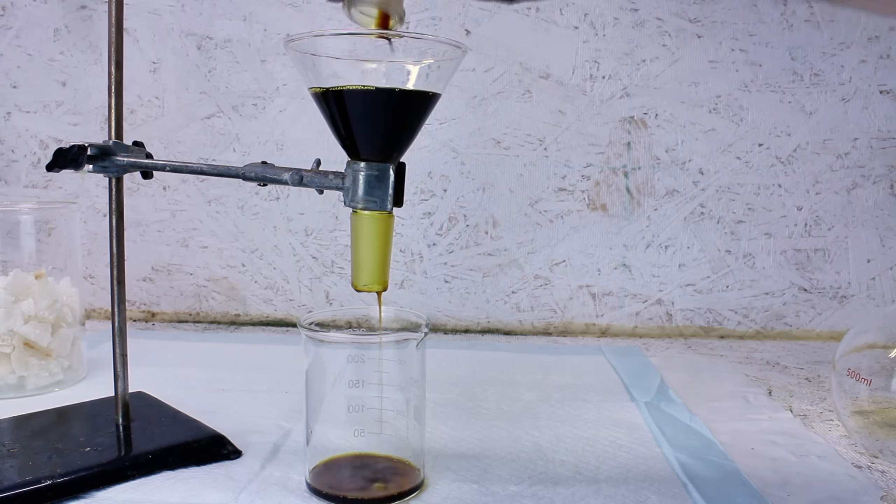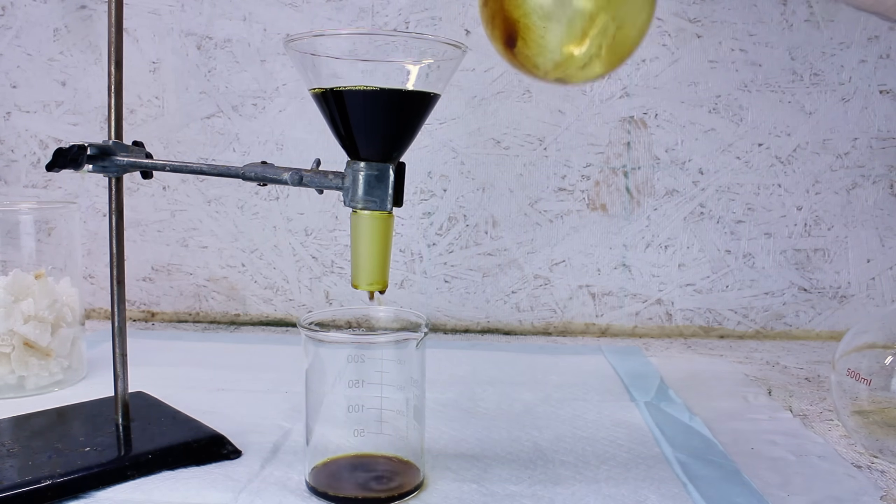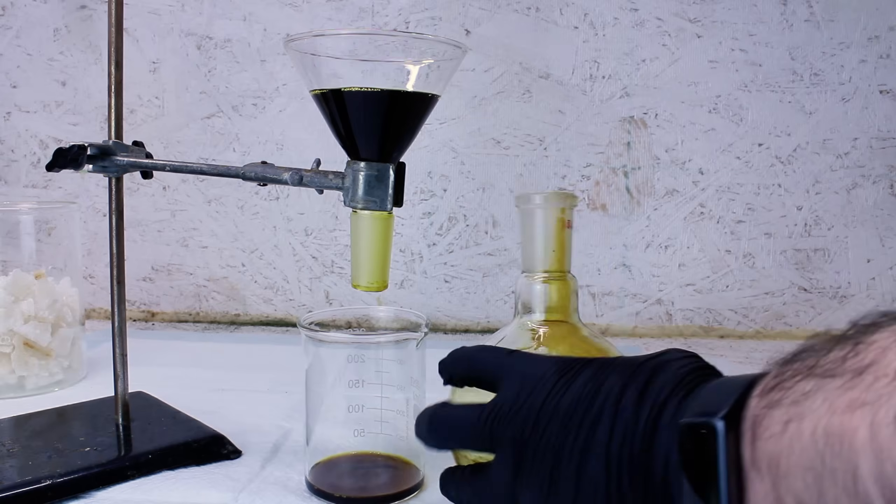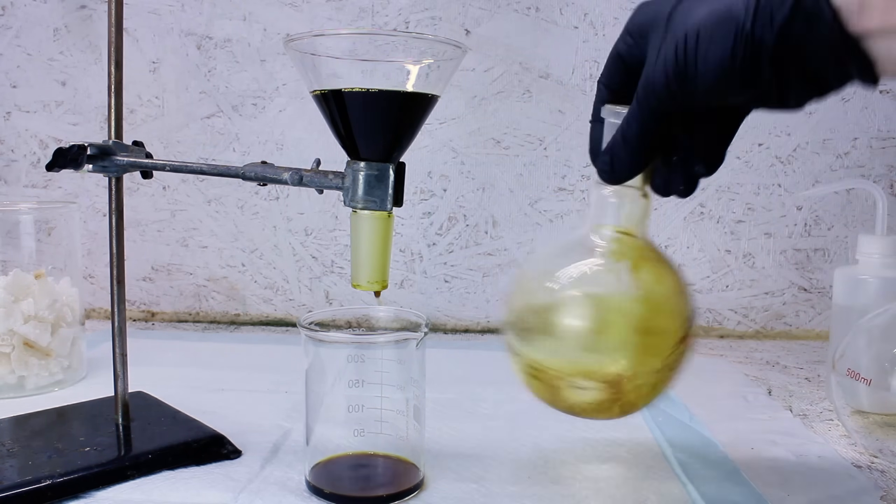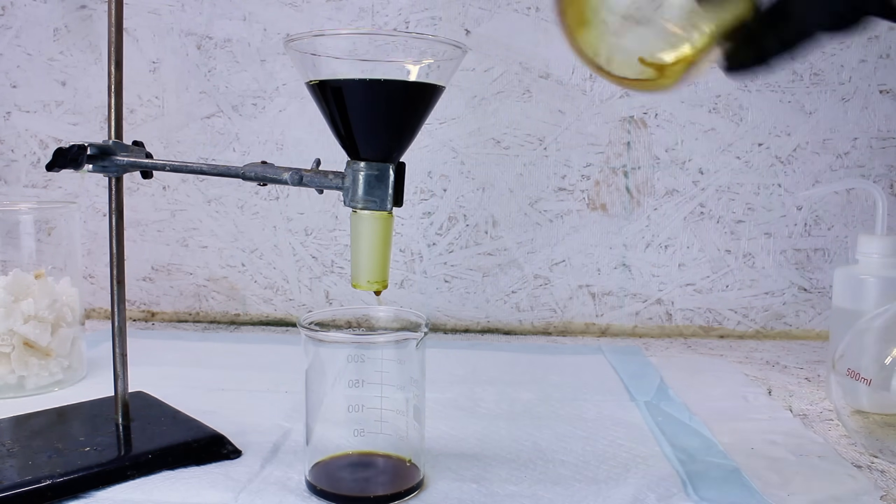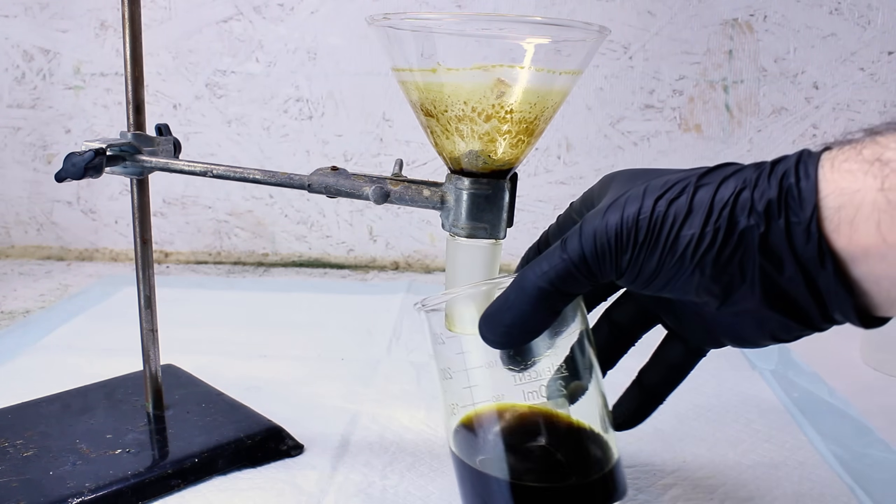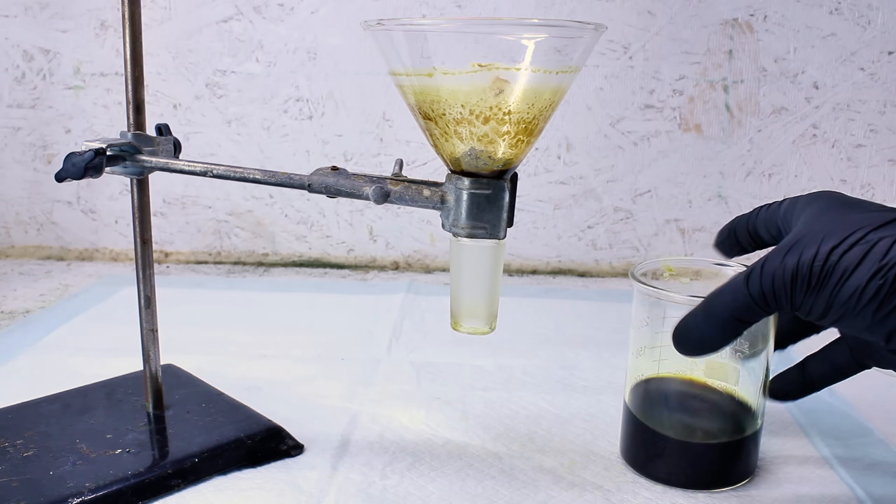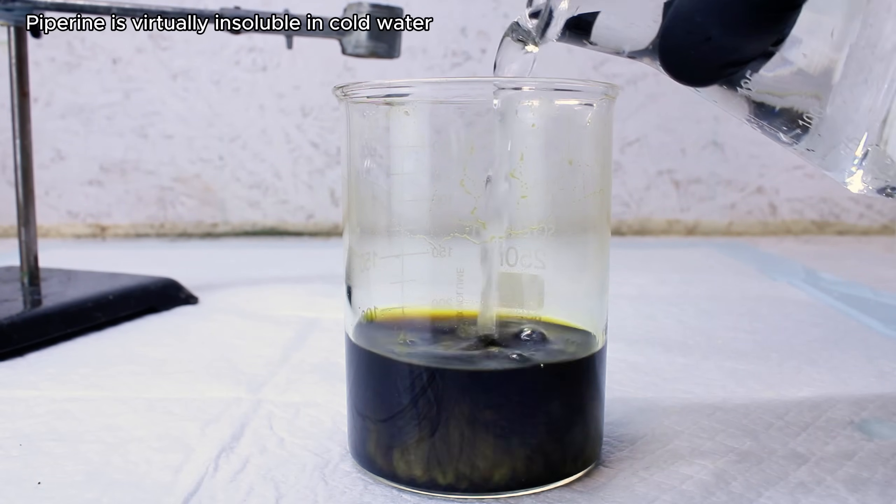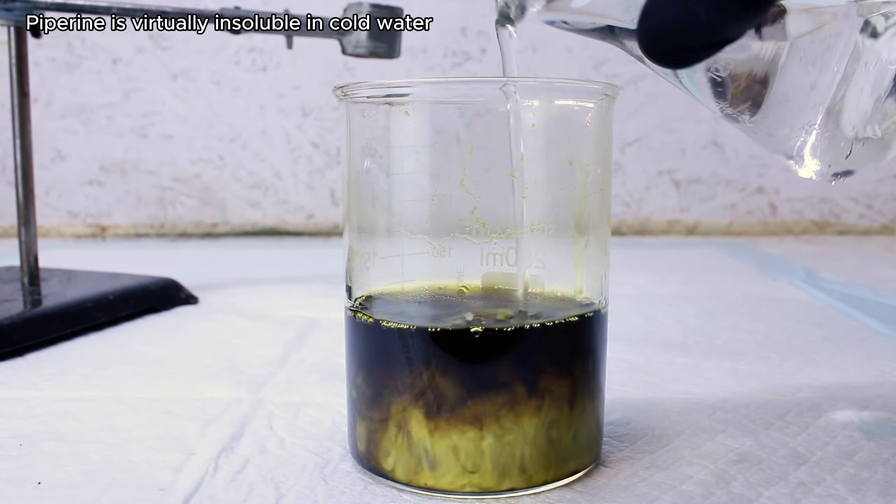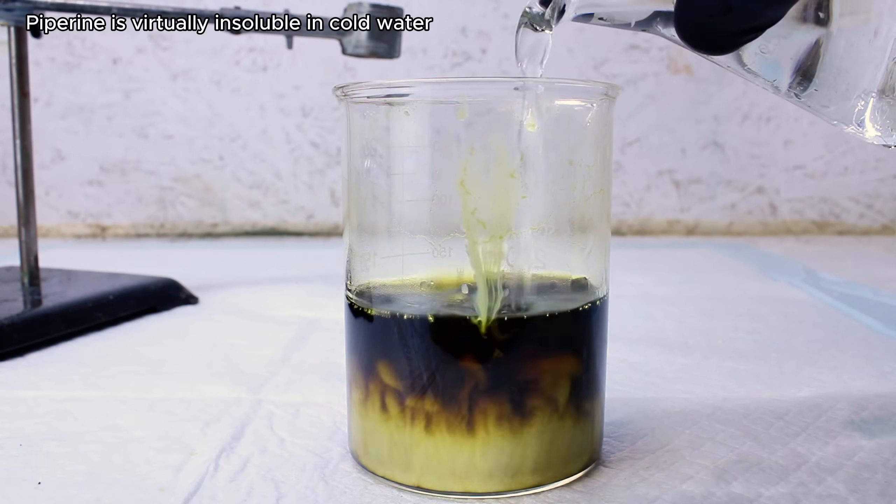This step ideally will leave me with a solution of now water-soluble plant oils and water-insoluble piperine. Now to actually separate out my piperine, all I need to do is very slowly add ice-cold water to the solution. Immediately upon adding the water, white clouds of piperine form as it crashes out of solution. This looks pretty cool, so I'm going to stop talking for a moment so you can watch it.